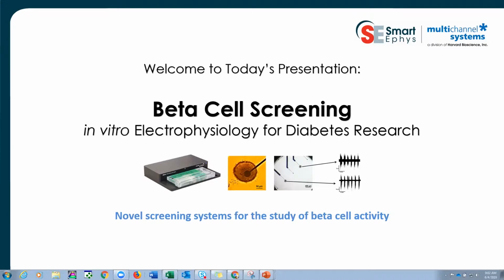Beta Screen is a novel suite of tools including multi-electrode arrays, fluidics control, and software designed to facilitate the analysis of electrogenic activity of the islets of Langerhans in both acute and chronic settings. Today's presentation will be delivered by Dr. Sven Schönecke, who is joining us from Multi-Channel Systems in Reutlingen, Germany.